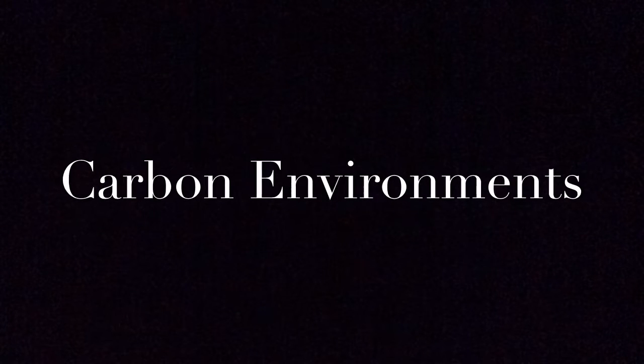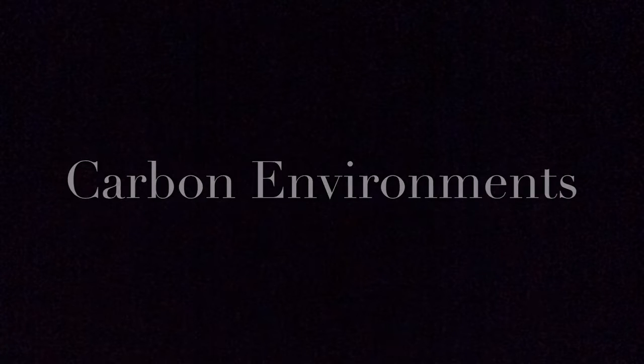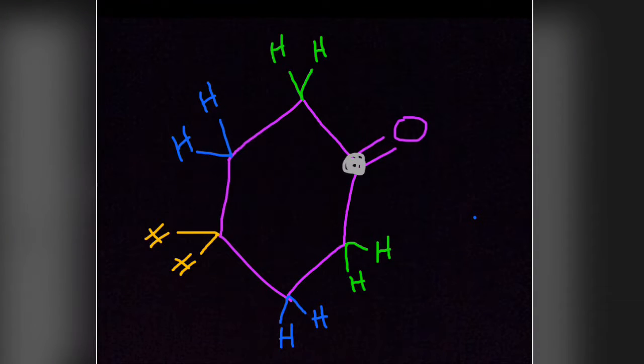Okay, so next we're also going to look at the carbon environment, and we're basically going to do the same thing like we did for the hydrogen one. So the first carbon environment is going to be where that ketone is, because there isn't anything like it on the structure, so that's one environment.